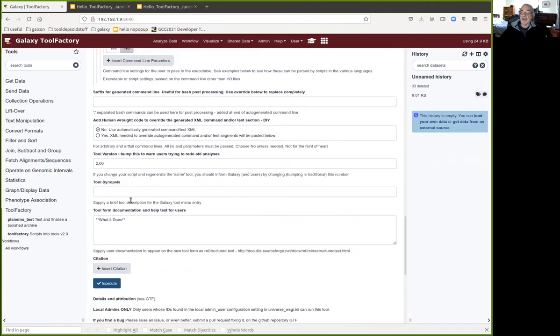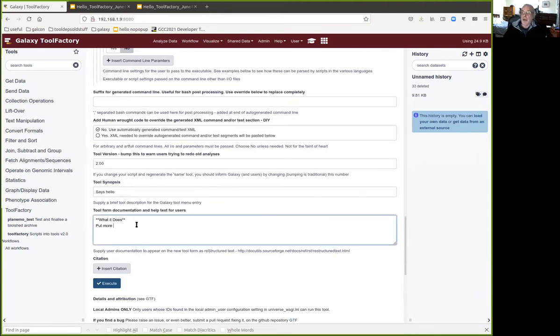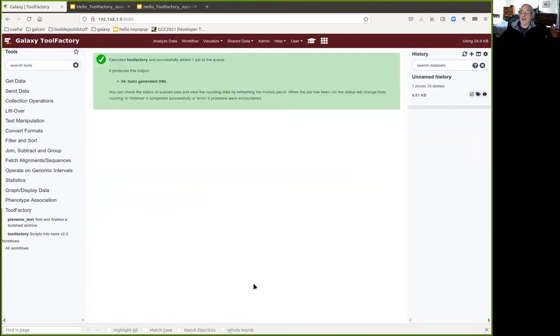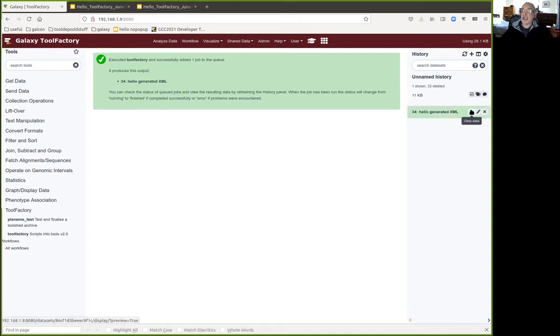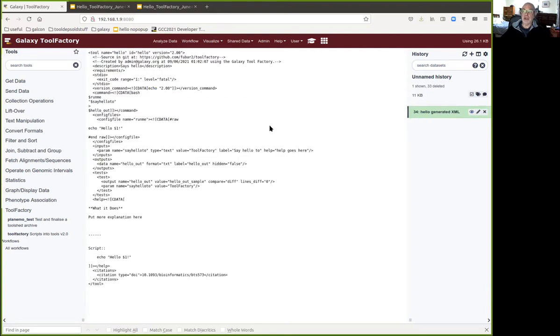We'll give it a synopsis — this will appear beside the name in the tool menu — and we can put explanatory text for what it does. We press execute. It's basically a normal Galaxy tool. If I click on the icon of the output XML, I can see a pretty normal Galaxy tool — not quite as complex as the Bowtie 2 example — but all this has been generated and contains everything we put on the form.